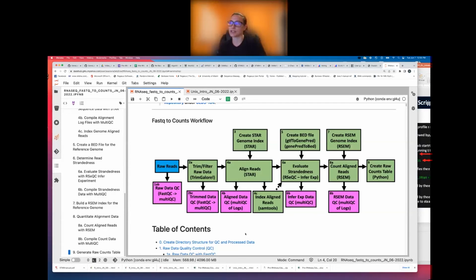I'm also untrusting and still new to the programming world. So I have spent way too much time checking and rechecking things manually, and then finding piecemeal code or asking my colleagues to write some code to do checks. And they're like, why? It's always going to do the same thing. I'm like, no, but we've got to check. I know that it makes them frustrated, but I'm just like you. I don't trust anything.